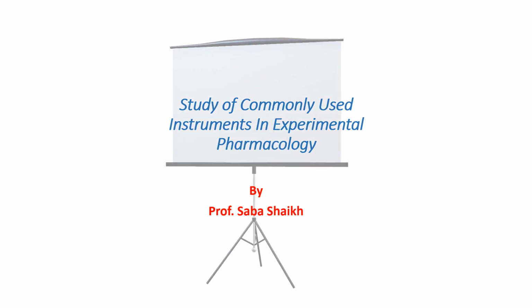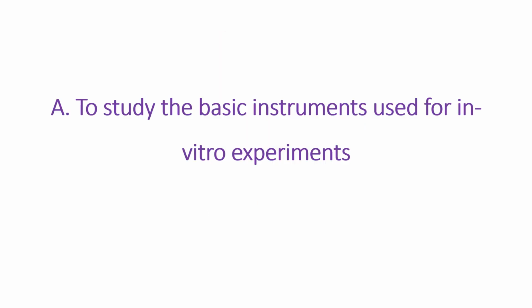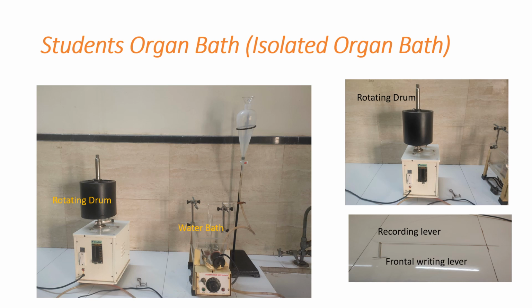Hello everyone. Today we'll discuss the study of commonly used instruments in experimental pharmacology by Professor Sabashek. So to study the basic instrument used for in vitro experimentation, the first instrument that we use for in vitro experimentation is the student organ bath, or it is also called as isolated organ bath.